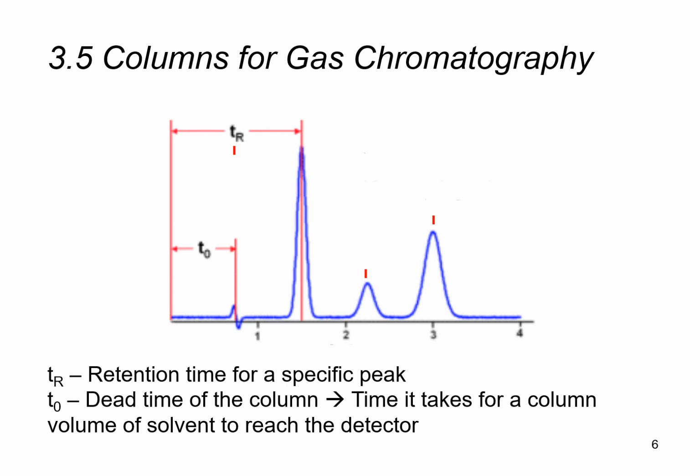But if we have the pure mobile phase that's flowing through the GC instrument, so we're talking about the pure helium gas or the nitrogen gas, it already takes a finite amount of time for this nitrogen gas or helium gas to travel through the column and to reach the detector, right? So even though it is completely unretained on the column, so it has no interaction with the column whatsoever, it still takes a finite amount of time to reach the detector after traveling through the column.